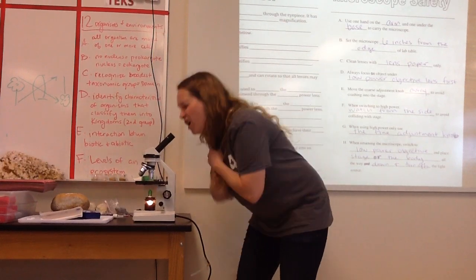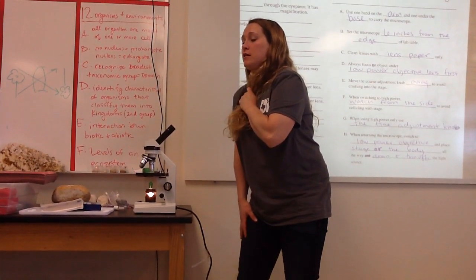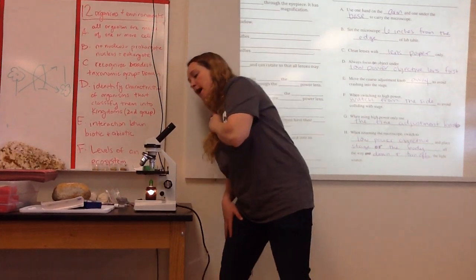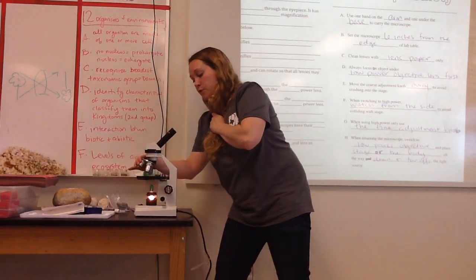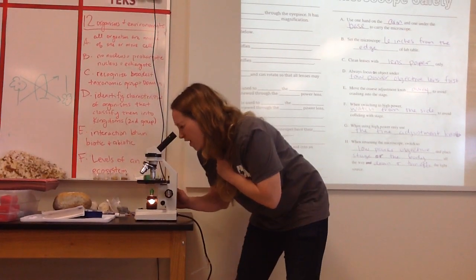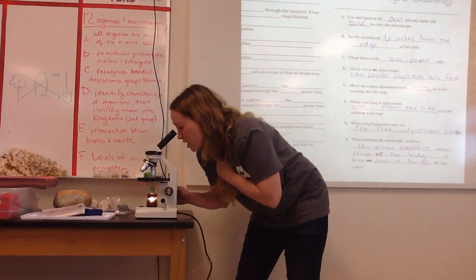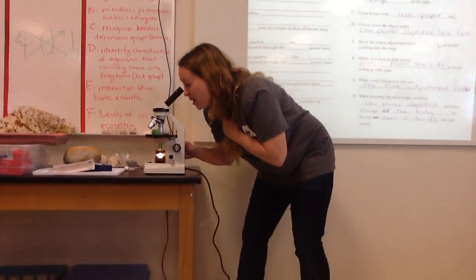Now I want to switch to the bigger power. What do I do? Take my eye away and look to the side, swivel to the bigger knob. Careful, careful, listen for the click. It's in place. Now I should be able to find it. Can I go forward with the coarse adjustment knob? Never. So you back up.